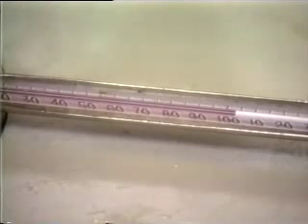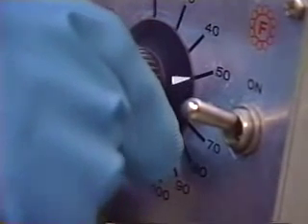When the temperature is 15 degrees below the anticipated melting point, turn it down to the indicated setting of 45. Carefully monitor the crystals through the eyepiece. Note the temperature at which they begin to melt, then the temperature at which they have all melted.